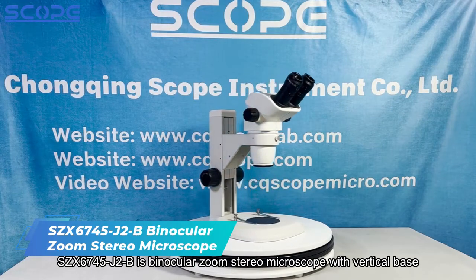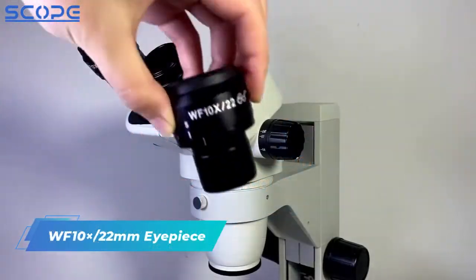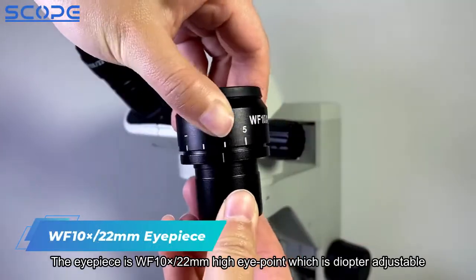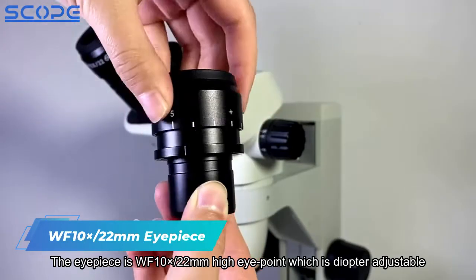SZX6745-J2-B is a binocular zoom stereo microscope with a vertical base. The eyepiece is WF10x, 22mm high eyepoint, which is diopter adjustable.